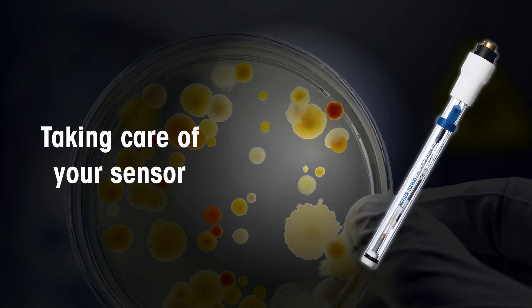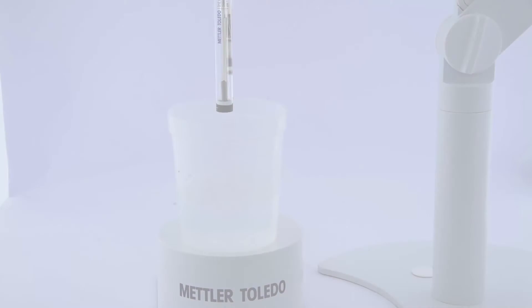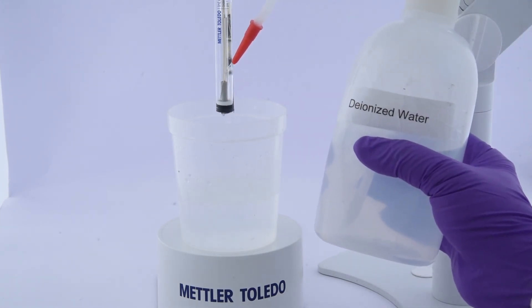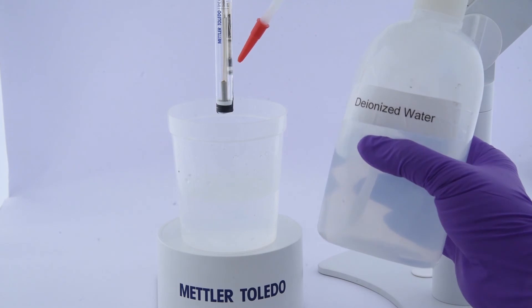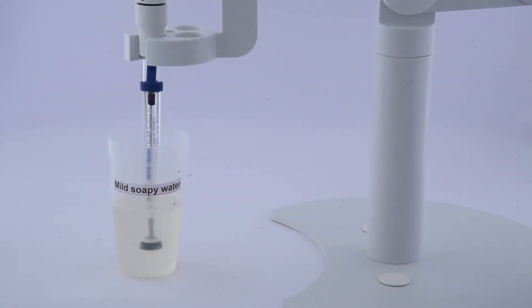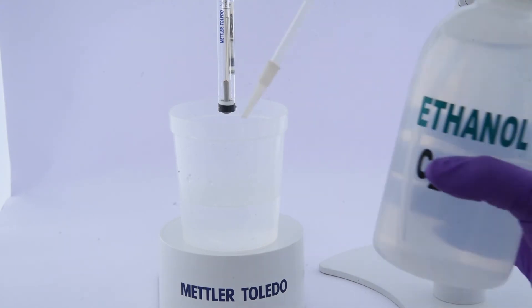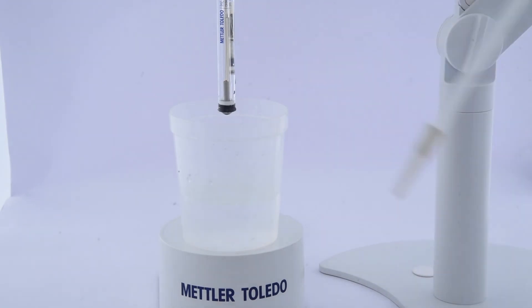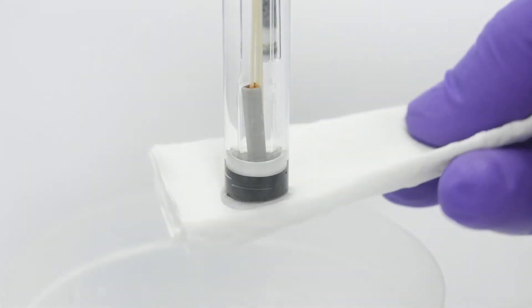Here are some tips and hints to ensure quick and accurate results. For thorough cleaning of sample residues from the electrode membrane after measurement, clean it with deionized water. Use mild soapy water or ethanol if required. After cleaning with ethanol, recondition the sensor in storage solution for two minutes. Do not rub the sensor surface; always blot dry with tissue paper to remove any excess water.